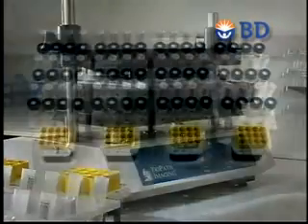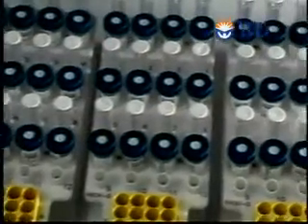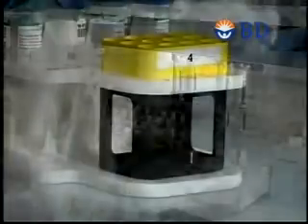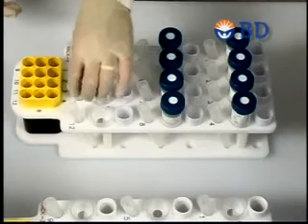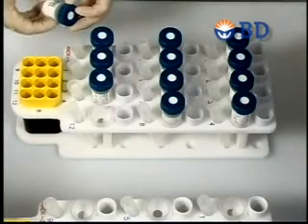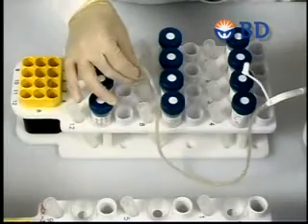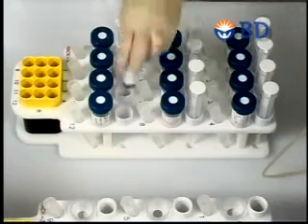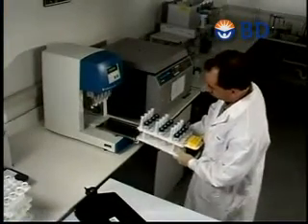4 PrepMate processing racks are provided and enable the organization and processing of samples. Each rack is numbered and keyed to accept only its corresponding centrifuge rack. This keyed system is maintained throughout the process, ensuring samples are always properly oriented. A PrepMate rack is loaded with SurePath specimen vials and the corresponding centrifuge tubes. 4 milliliters of density reagent are dispensed into each centrifuge tube. A disposable PrepMate syringe is then placed adjacent to each specimen vial, and the rack is ready to be loaded onto the automated PrepMate accessory.